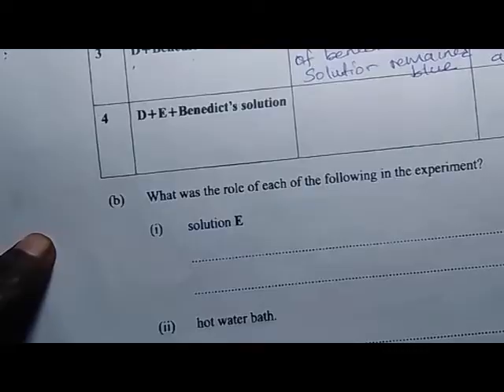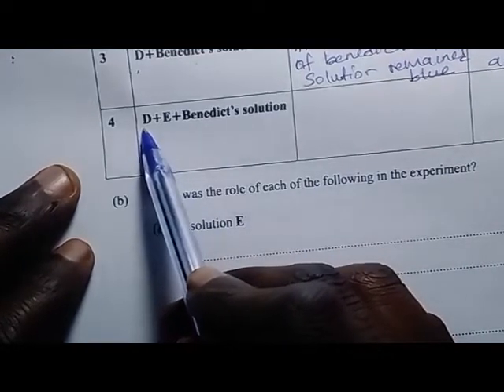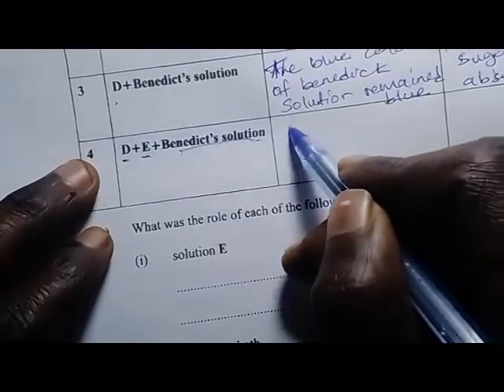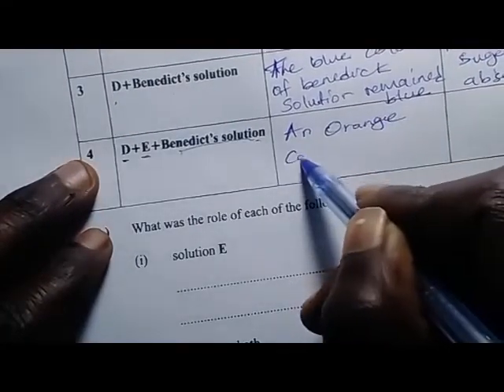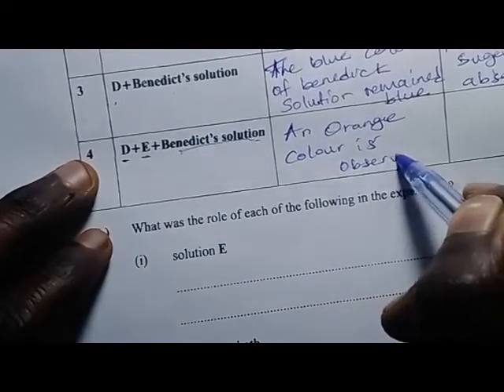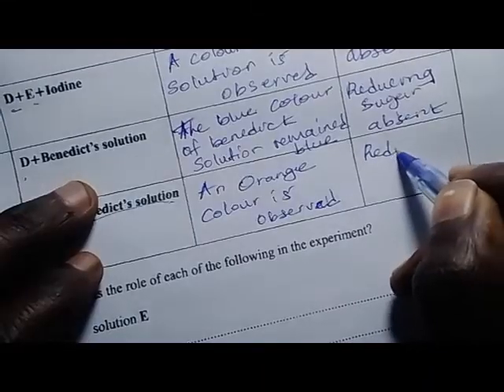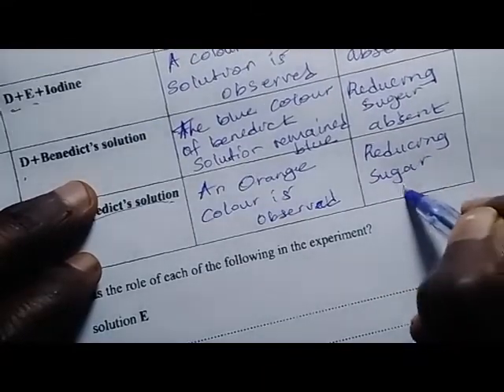In test tube 4, you have put solution D and E plus the Benedict solution, and you have observed that an orange color is observed. That is the observation. Now automatically reducing sugar present.